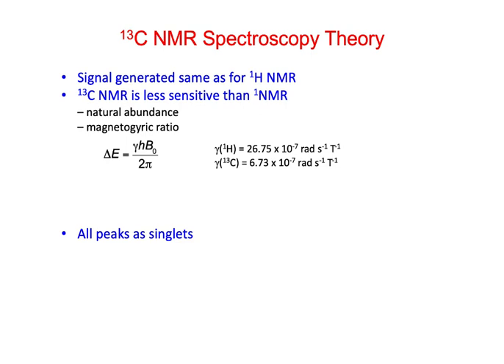All right, so C13 is much less sensitive than proton NMR because it has a low natural abundance of C13. And we talked about before, too, this magnetogyric ratio, this gamma, when we looked at this equation. I think maybe we mentioned that there was a big difference. So here's actual values for the magnetogyric ratios for proton. It's in whatever units here, radians per second per Tesla, whatever.